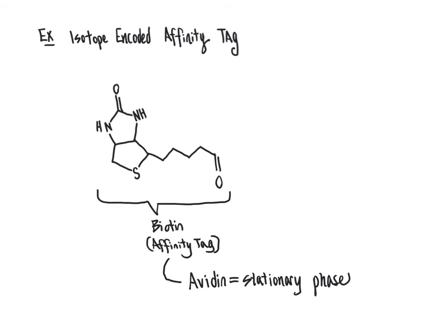And so this helps us down the pipeline in separating the isotope labeled proteins from other molecules that are not isotope labeled, to simplify the mixture for the mass spectrometry process, since it is not generally possible to look at a complete crude mixture of different compounds by mass spectrometry because the mass spectra become too complex and the presence of other compounds can interfere with the ability to detect compounds of interest.